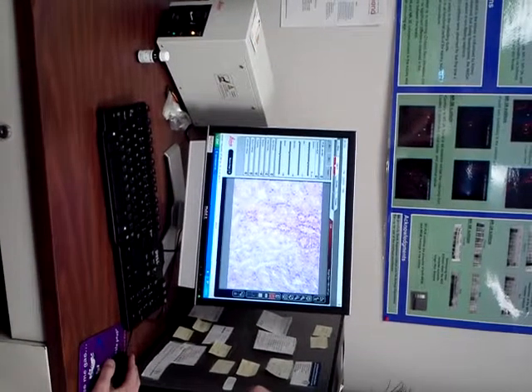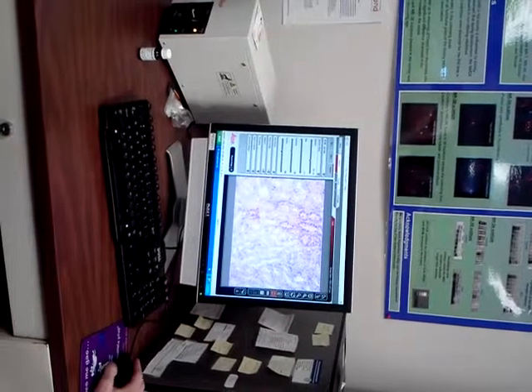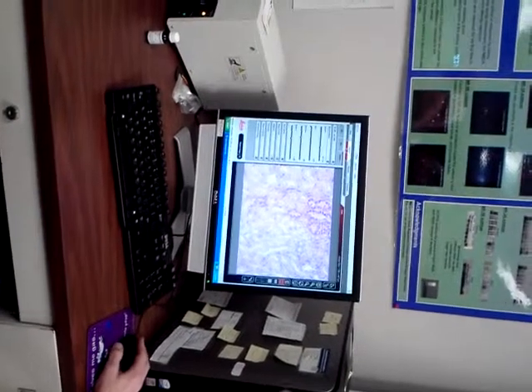So within Acquire, you'll spend most of your time in Acquire and some in Process. Probably not a lot in Browse, and I'll show you why. Within Acquire, you're going to want to be in the Camera tab. Microscope 1 and Microscope 2.